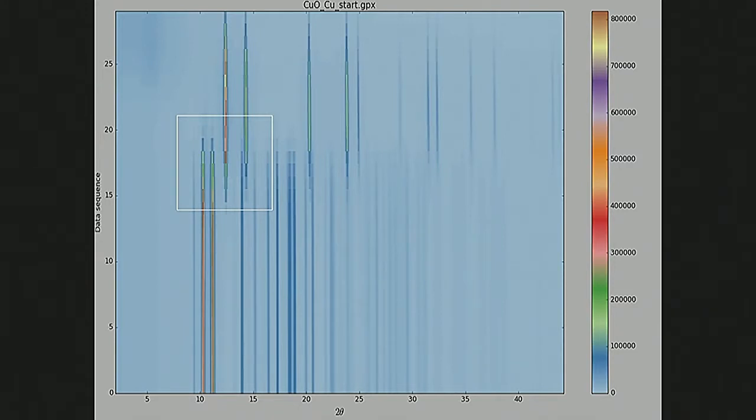So you did a good job of saying, basically kept getting a better refinement fit and reducing your percent by adding more parameters. And so do you know how many parameters did you end up with? And what limits that? Like, I assume you don't have vacancies in there or other, more complicated things. So how many parameters can you put in and how many did you have? That is certainly a sample-dependent question. For ours, I think we ended up fitting 6 parameters or so.